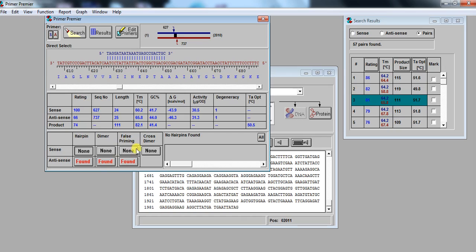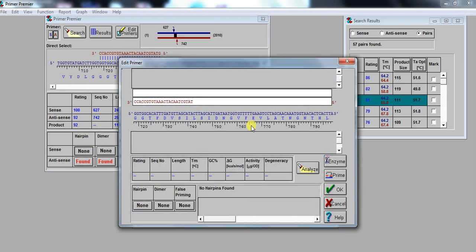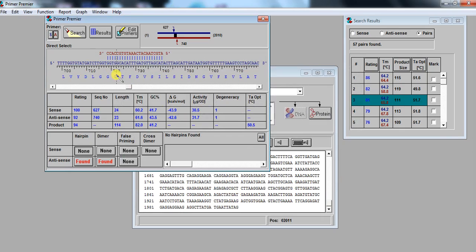Now also edit another one. Here at the 3 prime it starts with A, but if you remember, we said that it must start from C or G. So find any G at the strand, it's the G, so click here. We try to remove this hairpin. So if we delete some bases and then analyze, or another one, analyze, also here.